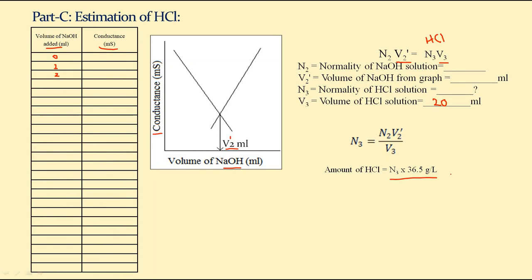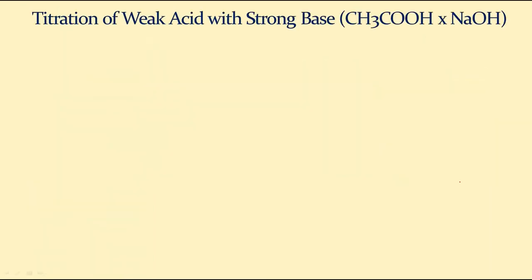For the remaining two experiments also, we have the same procedure, the same part A, part B, and part C, where we operate the instrument. So that is the reason I am not going to repeat the procedure; I will only explain the principle of the remaining two experiments, and thereby I will close the lecture.